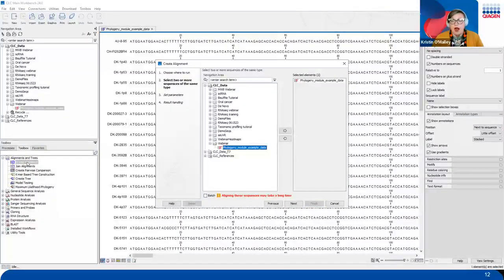And that will pop out a wizard driven guide that'll show us exactly how to generate this alignment and what we need to grab to generate this alignment. So the first thing that it's going to ask is where to run this. So I'm just running it on my laptop, but if you guys have maybe a server or a cloud instance, you'd be able to choose to run it on one of those instances. But today I'm just running everything on my Hewlett-Packard laptop.